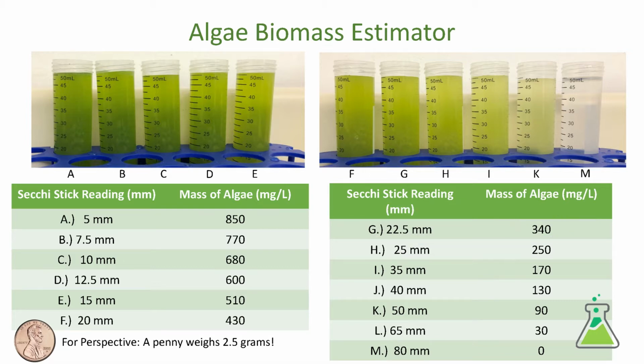So this is actually really interesting. From 170 to 340, it actually doubled in 2 days, which is pretty remarkable, a very quick growth rate. And so what that's showing us is we are getting more algae from day 2 to day 4. So our algae is growing, so it must be nice and happy. So go ahead and on the worksheet here, down at this corner, you'll put in 340 milligrams of algae per liter.